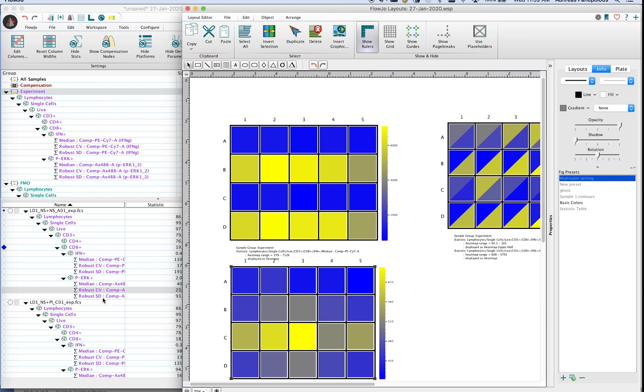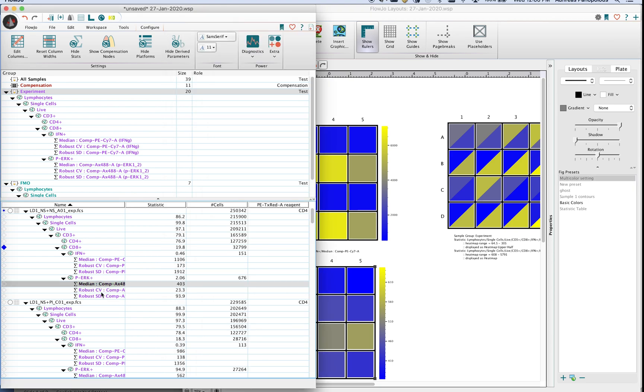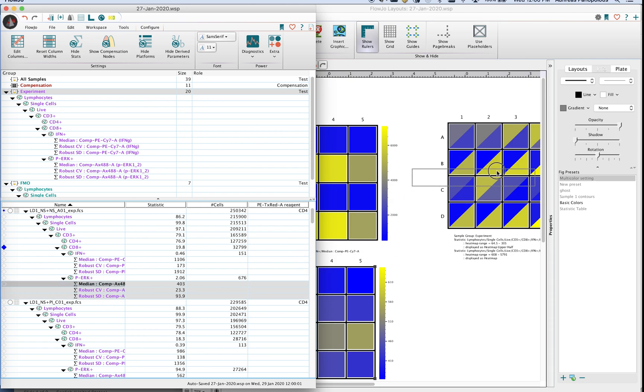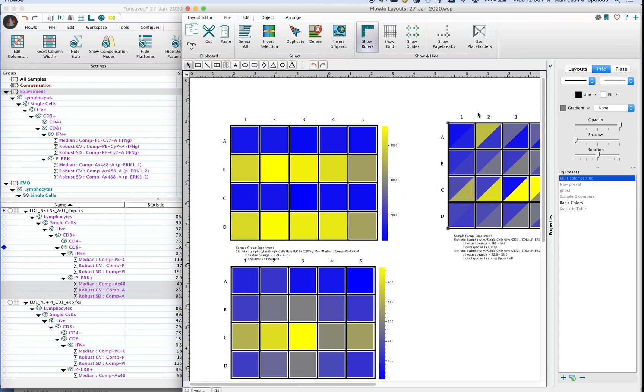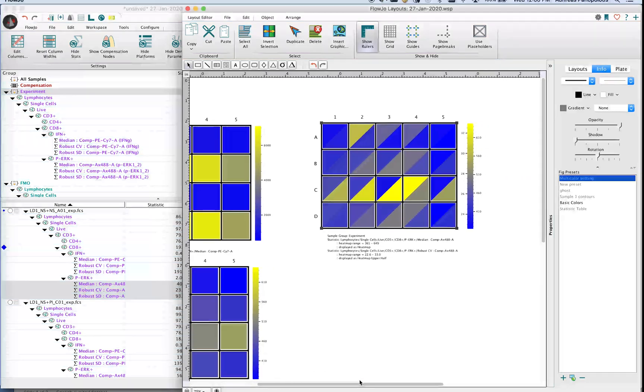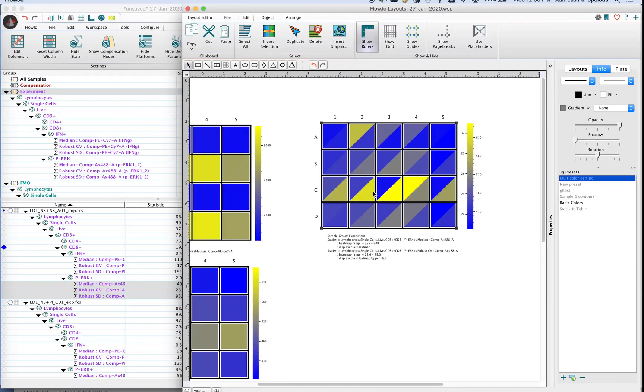However there is an upper limit of 11 statistics total per plate. But again if you're using the heat map option you can only visualize them two at a time.